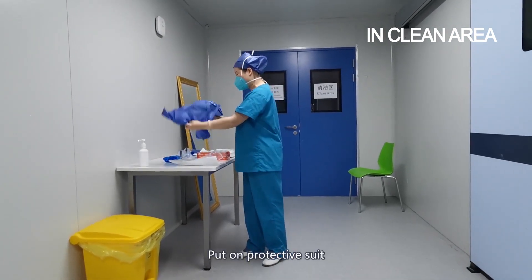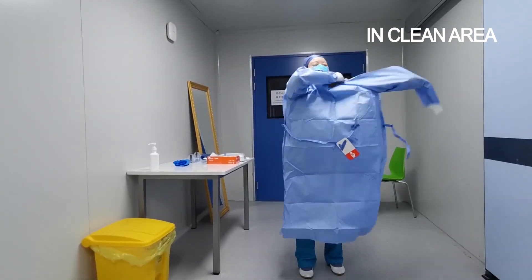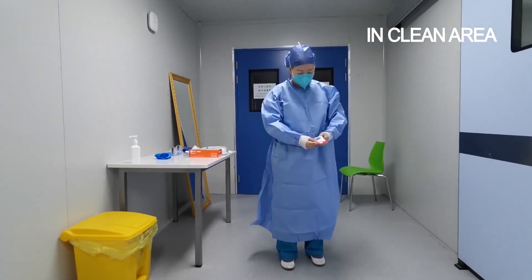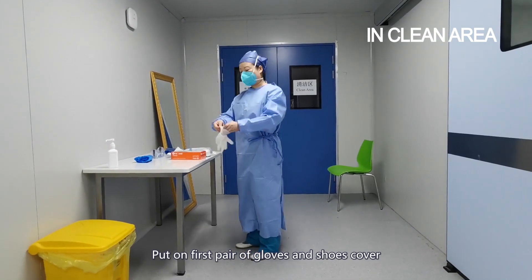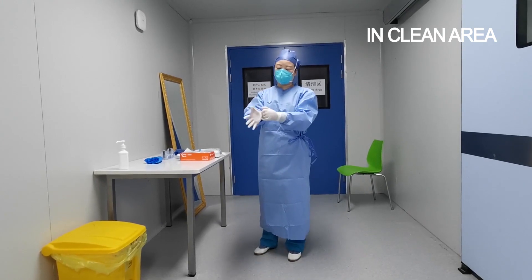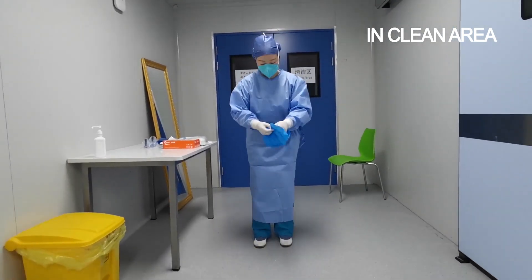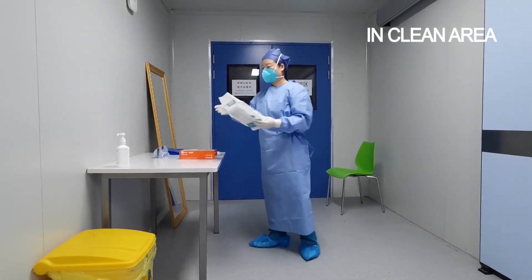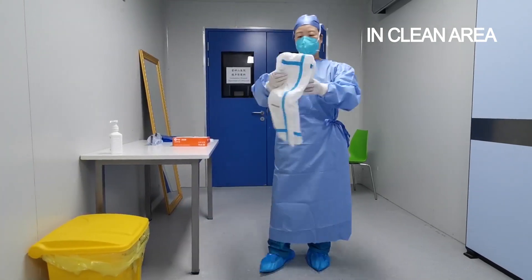Put on protective suits. Put on the first pair of gloves and shoes cover. Put on the medical cover.